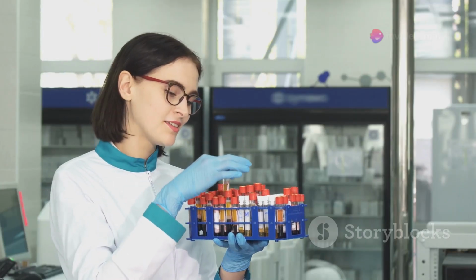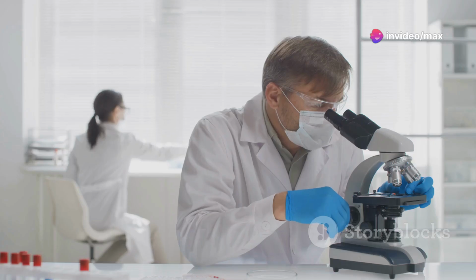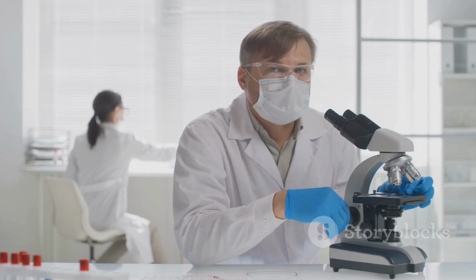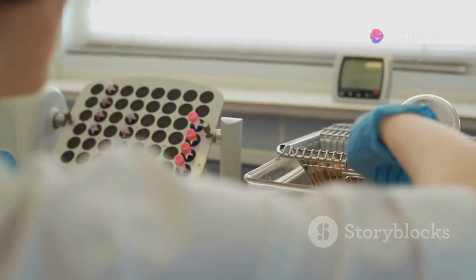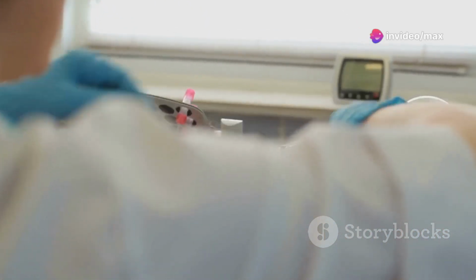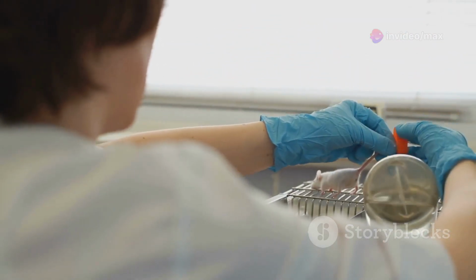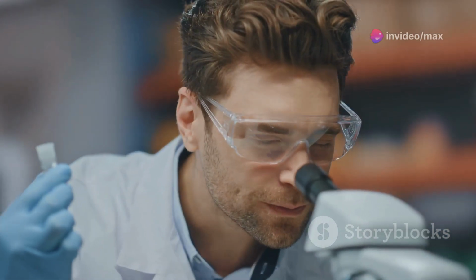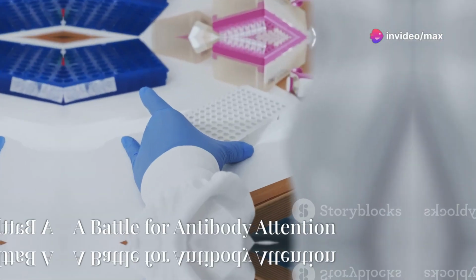However, sandwich ELISA also has a few limitations. Finding two antibodies that bind to different epitopes on the target antigen without interfering with each other can be challenging. Sandwich ELISAs often require careful optimization of antibody concentrations and incubation times to achieve optimal performance. Despite these limitations, sandwich ELISA remains a powerful tool in diagnostics and research.